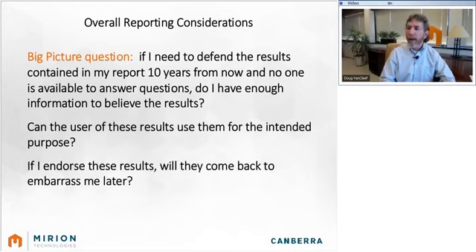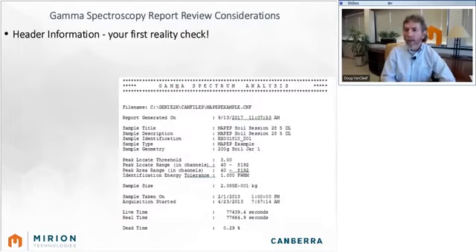And finally, if I endorse these results, will they come back to embarrass me later? So, how do we decide if this report is going to keep us from being embarrassed, give us results that the end user can use, and we'll have enough information to be able to reproduce it later on?